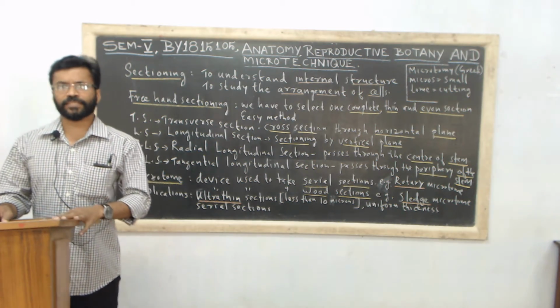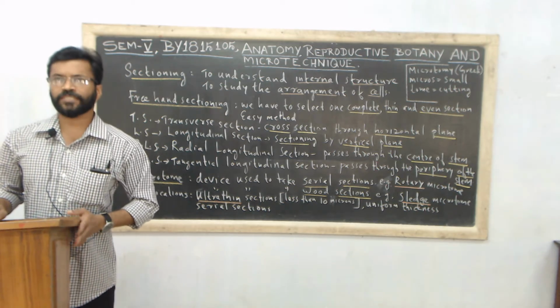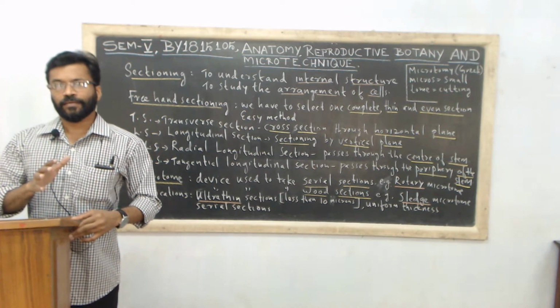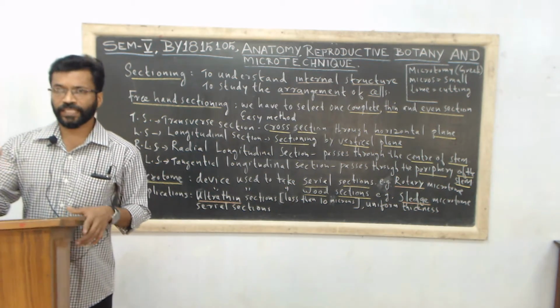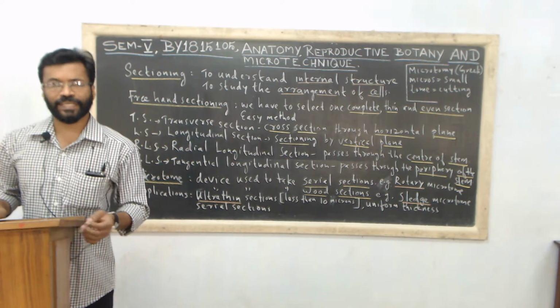The advantages. What are the advantages of freehand sectioning? The first one is it is easy to practice, and there is no need of a sophisticated instrument. We can practice freehand sectioning with the help of a mere blade or knife or razor.